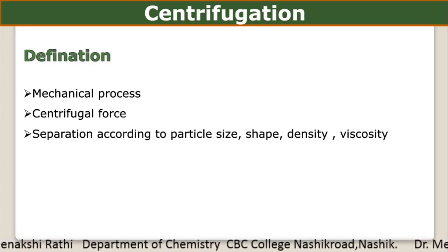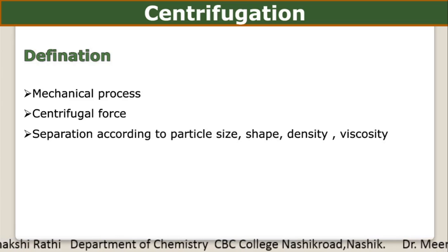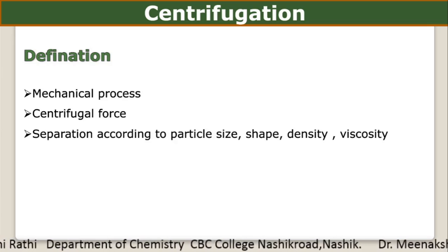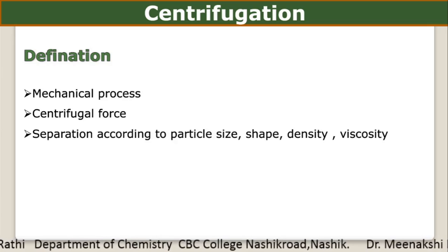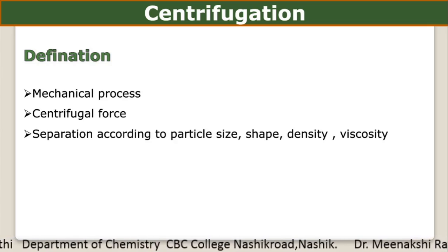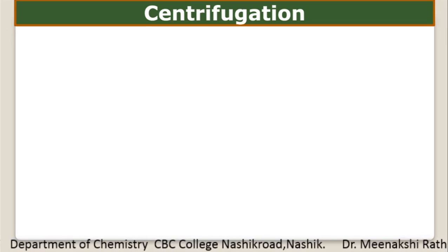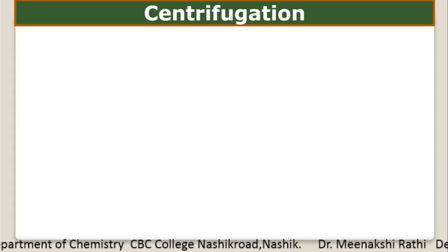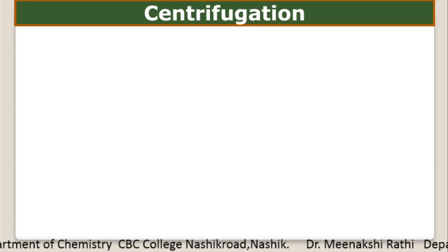In centrifugation, separation of molecules is done based on their size, shape, density and viscosity. The molecules whose density or size is bigger get settled down easily.